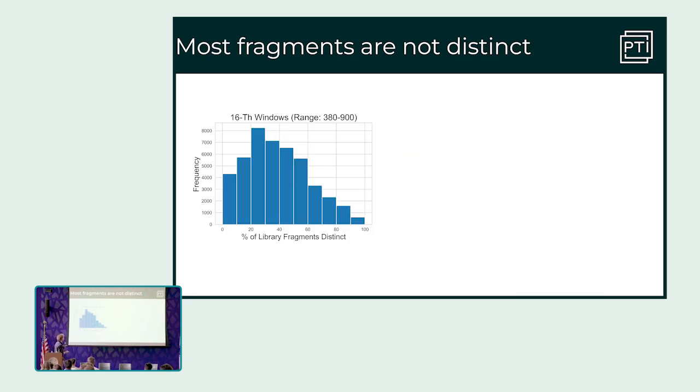And we can look at the rate of this, so how many peaks are considered distinct for each peptide, each precursor. And when I say precursor, I should note, to limit the jargon, a precursor is a peptide with a given charge state. And so what fraction of those fragments are distinct for a given peptide? Well, we do this in silico with a set of observed peptides we've seen previously, about 70,000.